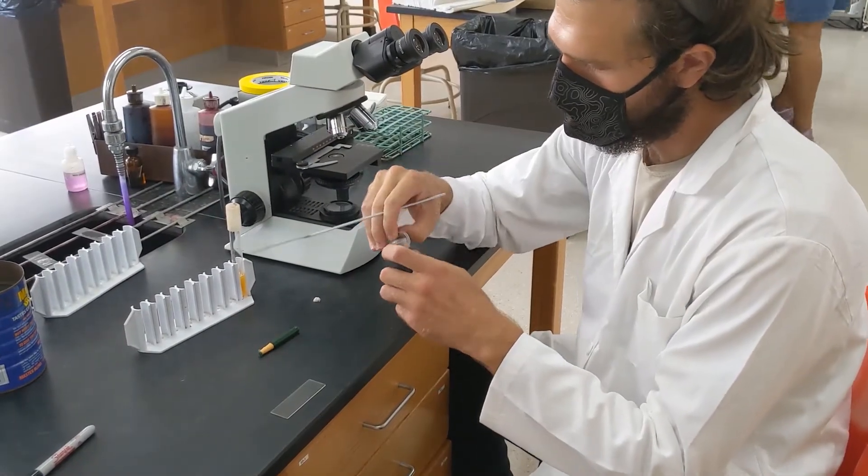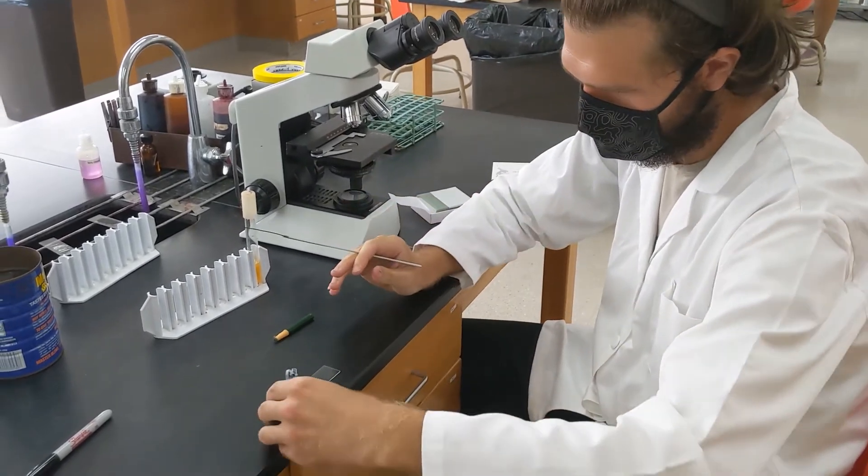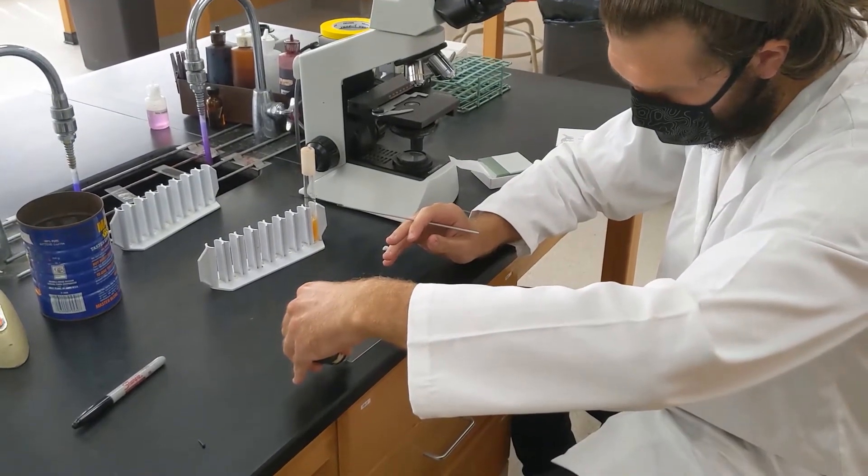So another method you can use to make indirect stain, you can take your nigrosin stain and put it on the very edge of the slide, like so.